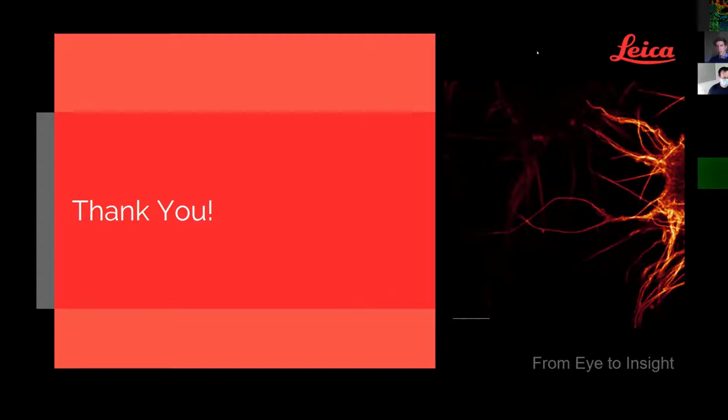Resolution, of course, is different. If you have a very scattering tissue, you have to keep in mind that your emitted fluorescence also needs to come out of your sample again. And the more scattering you have, the more that will reduce your resolution, of course. But in principle, there are good ways to also work deeper in your sample.